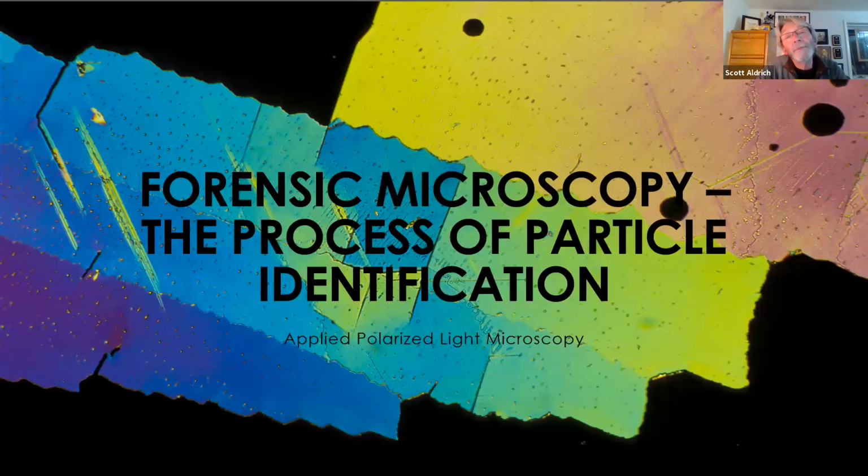So what about the forensic microscopy that I used, which generates great photomicrographs? The background of this title slide is a very small section of niacinamide, a vitamin, and it's a relatively pure material, probably a 99% source material.